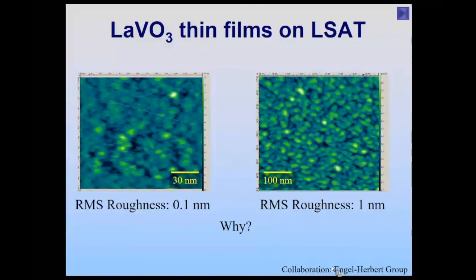In an AFM image, you're looking at some contour of constant force, be it a contact force as you're dragging the contact AFM across the surface, or a tapping force where you're trying to measure some average force over the distance at which you're oscillating it. All of that is measuring a force. Now, what leads to the force is certainly going to be interactions between electrons in the material and electrons in the tip, but it's certainly not directly proportional to the density of states, so the topographies can be very different from an AFM and an STM.